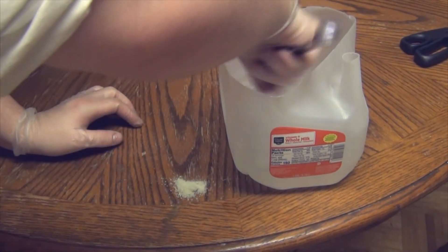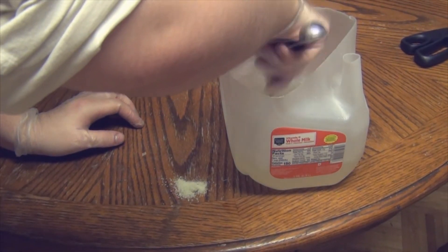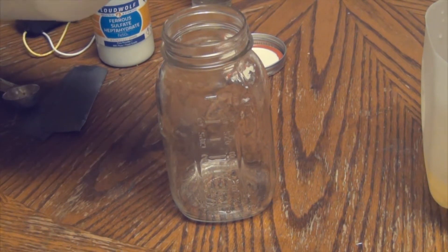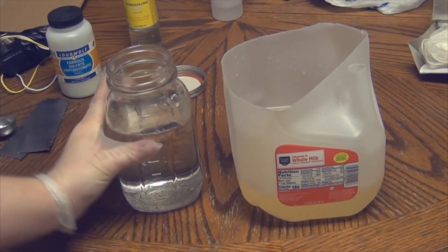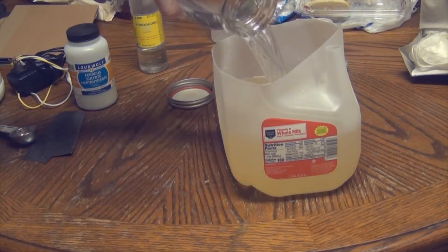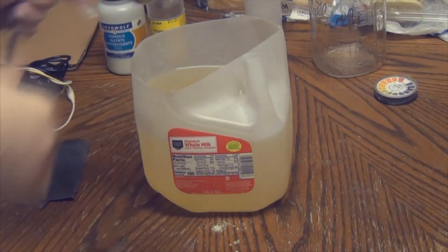Mix everything and make sure it's fully dissolved. I didn't think I had enough in the container, so I mixed up another liter of solution with another 15 milliliters of ferrous sulfate — I wanted the electrodes to get completely covered. Go ahead and pour in the other 24 ounces along with the other 8 ounces and get that into the container.